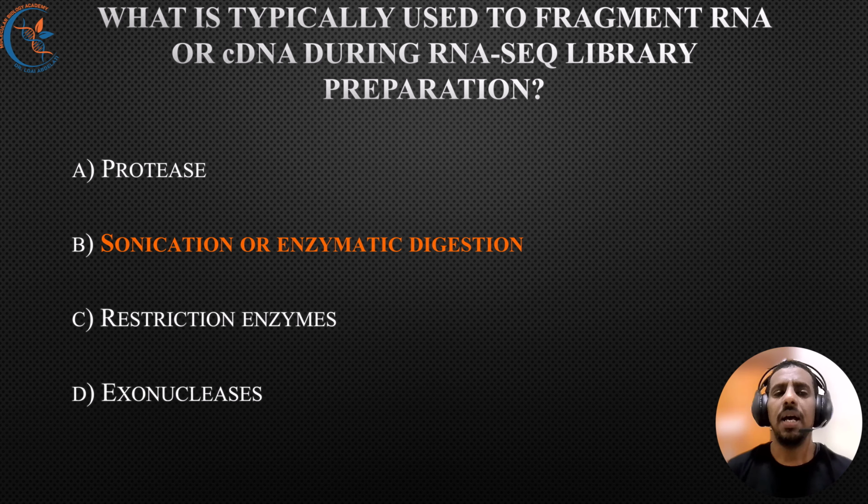All right. RNA or cDNA is fragmented using methods like sonication or specific enzymes to produce smaller fragments that are ideal for sequencing. All right. So the correct answer here is sonication or enzymatic digestion.